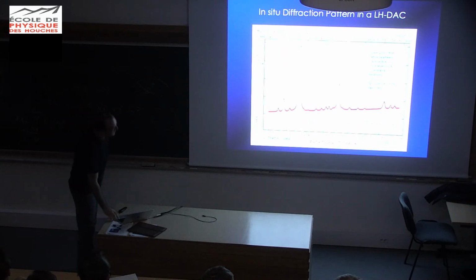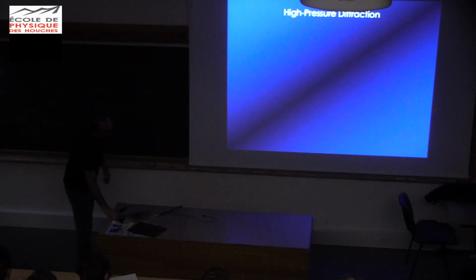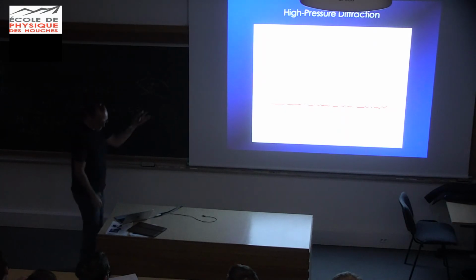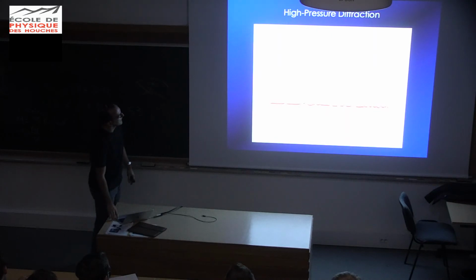Okay, so this is why you measure this. A typical example: here we're just changing pressure. It's the same sample at 15 GPa, 22 GPa, 28 GPa. This is hematite. What you see is that all the peaks remain the same but shift to higher angles. Higher angles mean smaller d-spacings, and it's normal because as you increase pressure, volume shrinks. So this is what this is showing you, okay?